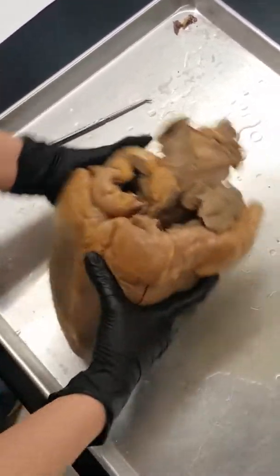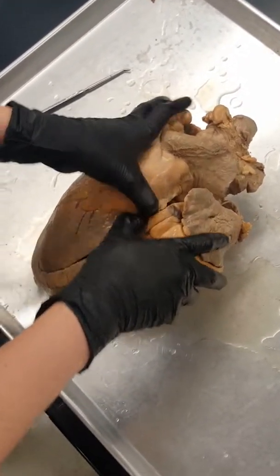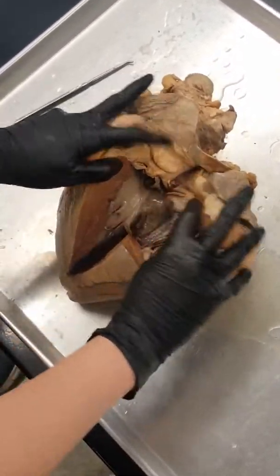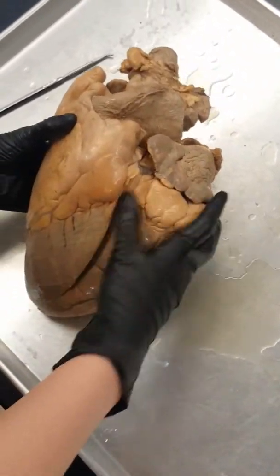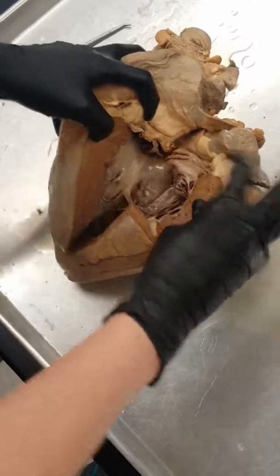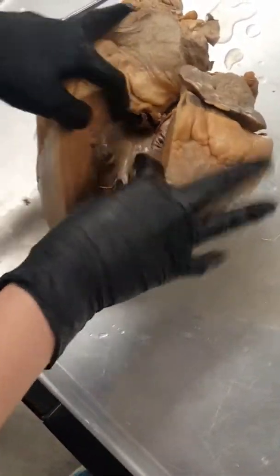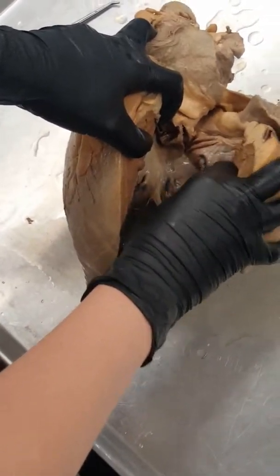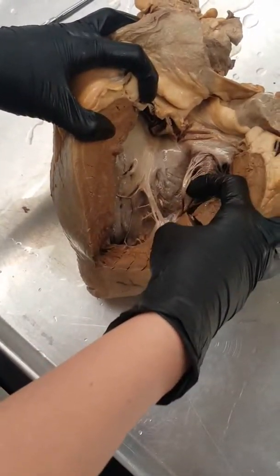If we flip it around to the other side, this big one coming right off the top is going to be our aorta — this big opening right here. It kind of comes right out of the middle up top. And then this one is going to be our right auricle.